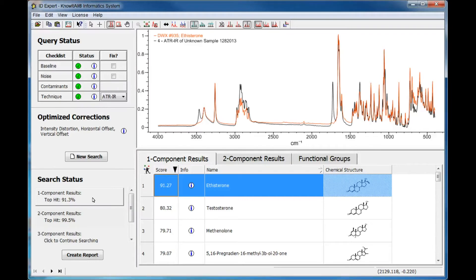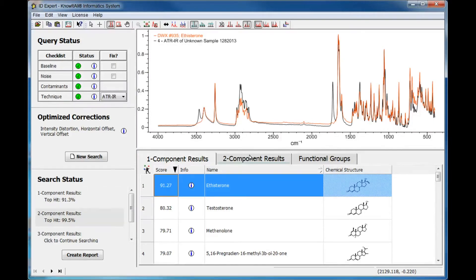The multi-component tab flashes to let you know a better match has been found. Click on that tab to view the results. Two steroids are clearly identified in the spectrum as a 99.5% match. Click the Information icon to view more information on each component identified.